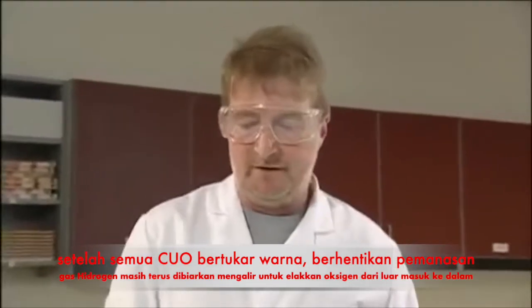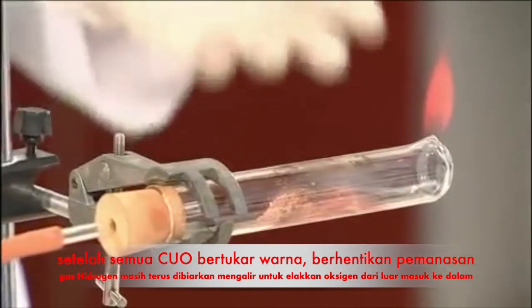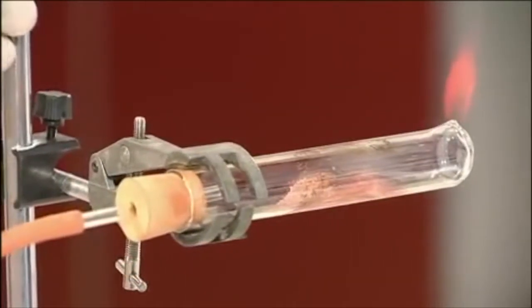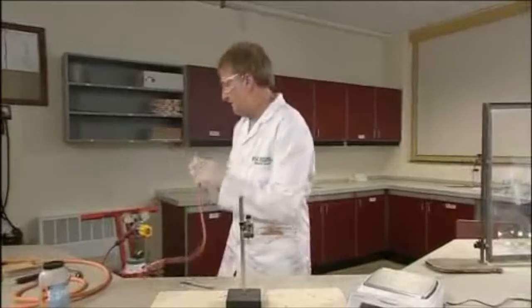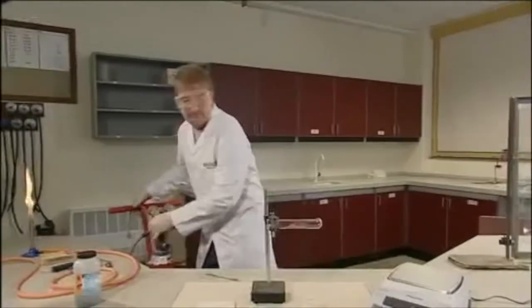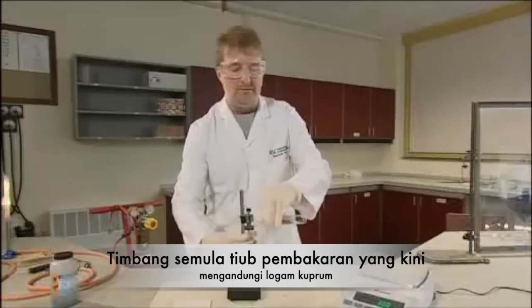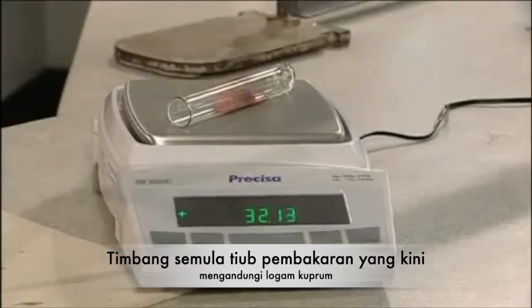It's now important to leave the apparatus exactly as it is with the hydrogen flowing. This is to prevent air from diffusing back into the reduction tube and converting some of the hot copper back to the oxide. Continue until the tube is cool enough to touch comfortably. We now blow out the flame. Remove the hydrogen delivery tube and turn off the cylinder. And reweigh the tube, which now contains copper.